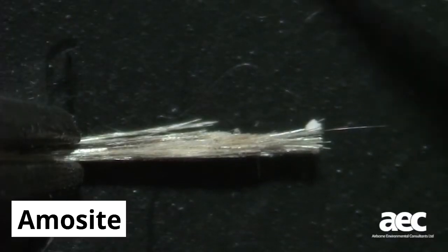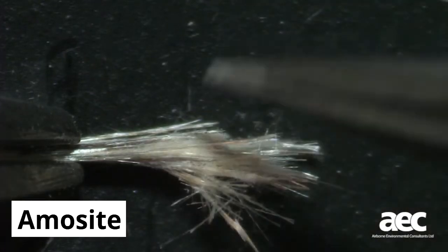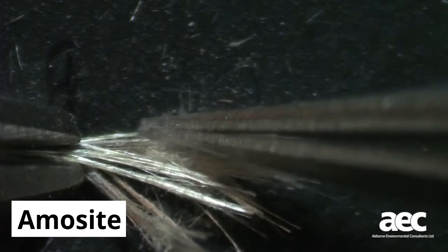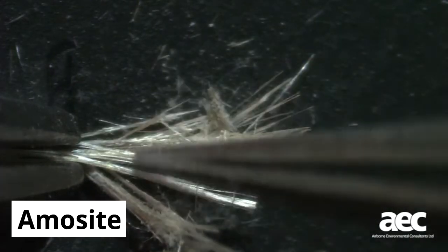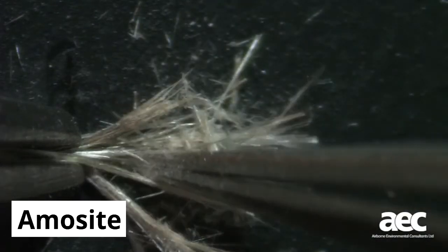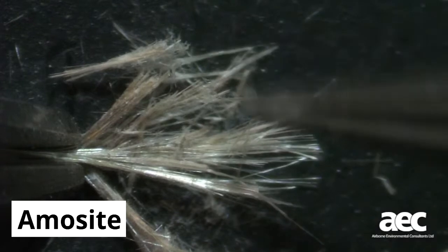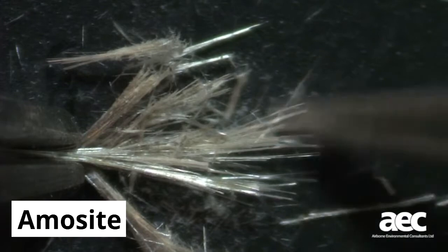Amosite presents as short, straight, grey to brown coloured fibres that have a paintbrush end effect, or form in small bundles. The analyst would assess the fibre by first separating them from the sample, and then manipulating them under the microscope. Here you can see that amosite fibres are straight and very brittle, shattering quickly when brushed with tweezers.